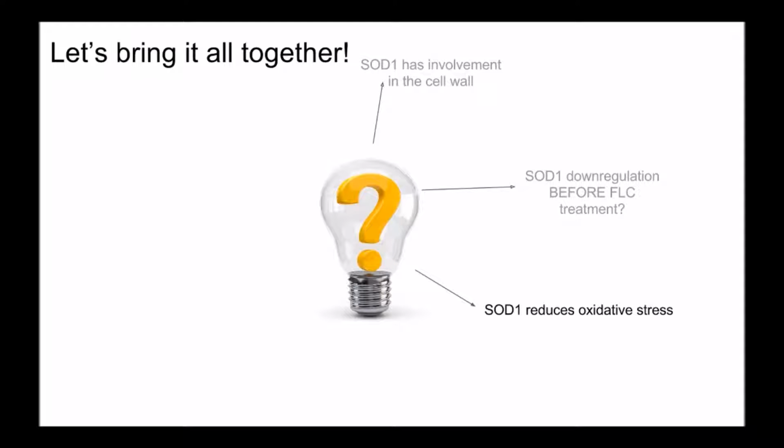The mutant strain's viability also appeared reduced when oxidative stress was applied, confirming that SOD1 protein functions to reduce the impact of reactive oxygen species. Therefore, without this function, the yeast's ability to cope with oxidative stress was reduced. While some interaction between H2O2 and fluconazole was shown, and growth was inhibited compared to our controls, the SOD knockout strain seemed to grow better than the wild type. As mentioned earlier, this seemed to be dosage dependent and further research would need to be done to completely understand this interaction.